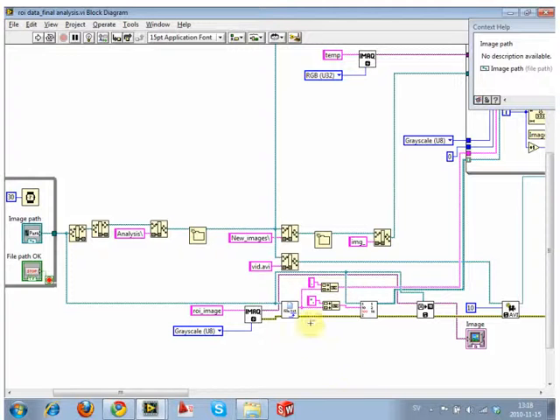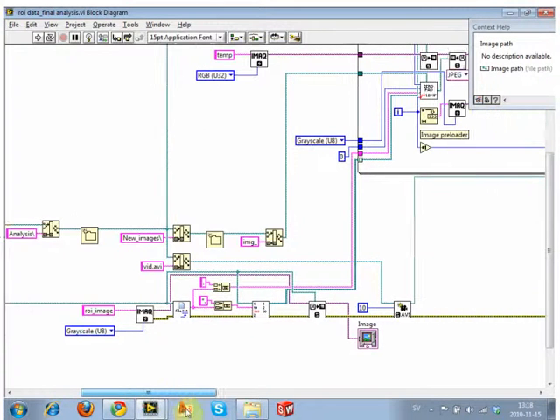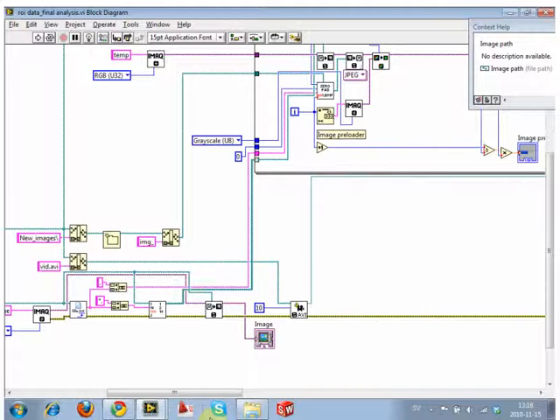So I'll show you what we're doing here. A lot of this is about, at the end of the day, wanting a streamlined program. You want it running as efficiently as possible, especially for analyses that you need to do over and over and over again. And this is what we're trying to achieve by all of this organization up front.